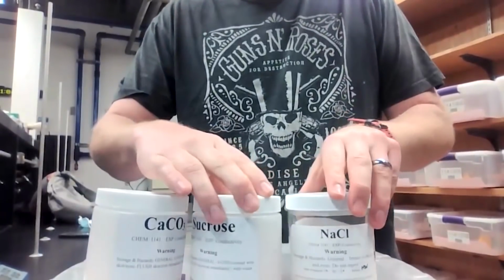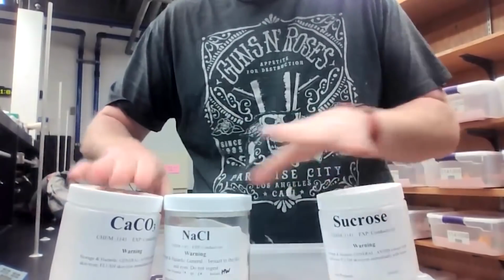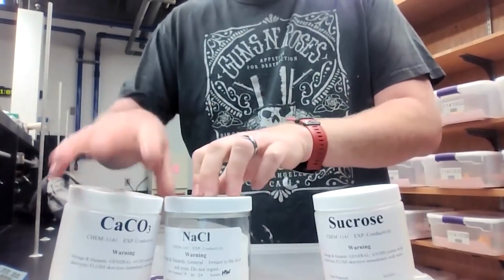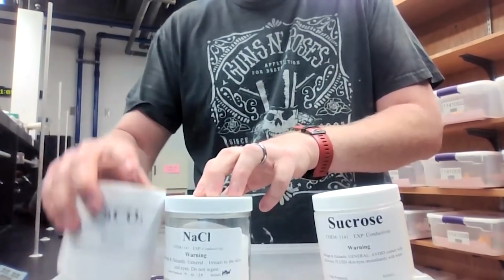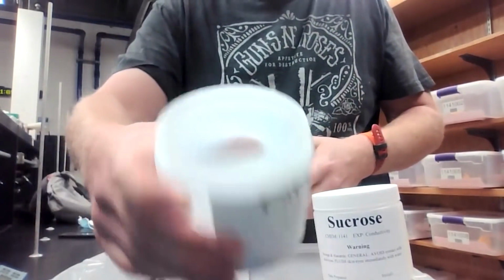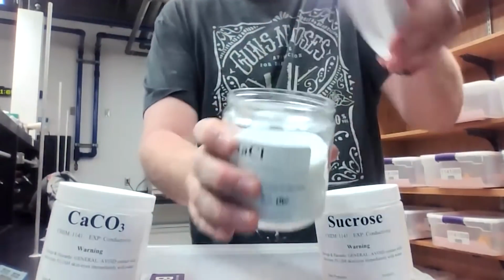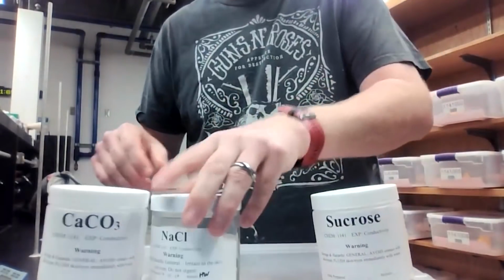Okay, so I'm going to put these two solutions together: calcium carbonate and sodium chloride. These two solutions are grouped together because they are both ionic solutions. This is a calcium ion and carbonate ions, making calcium carbonate, which looks a little bit like that. It looks like chalk. Well, the reason is because it is chalk. Okay, sodium chloride, standard table salt, also a white powder, or a white grain substance.